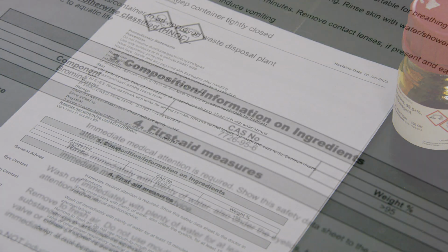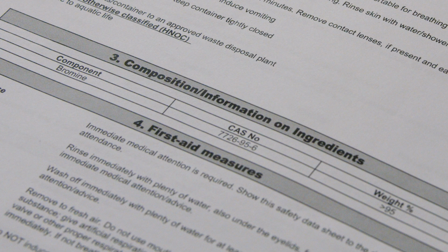In Section 3, you'll find composition and information on ingredients. This section shows the chemical ingredients and their concentrations. It's like the recipe of the chemical.